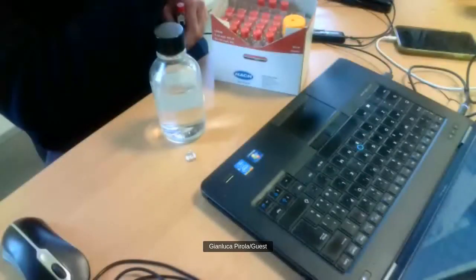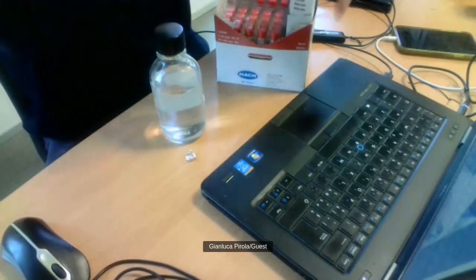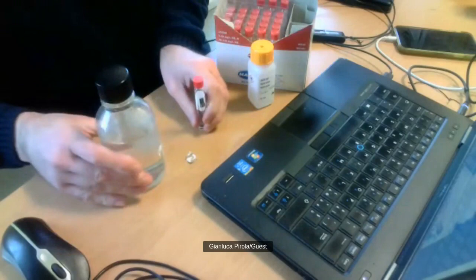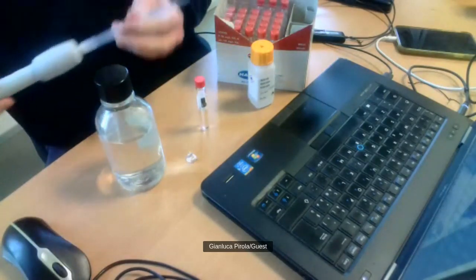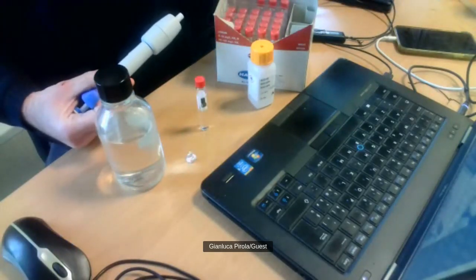Then we have to put 1 milliliter of reagent A. This method has another reagent which is inside the box. All the reagents are inside the box. Reagent A. So we have to change the tip of the pipette. Sorry, we have to change the tip.